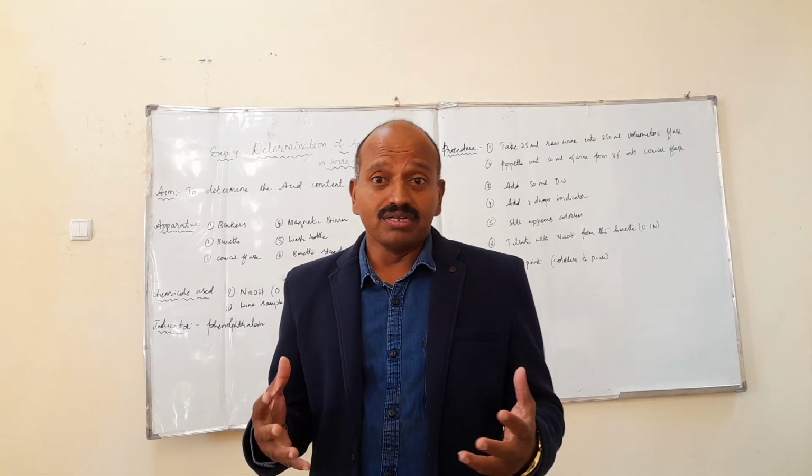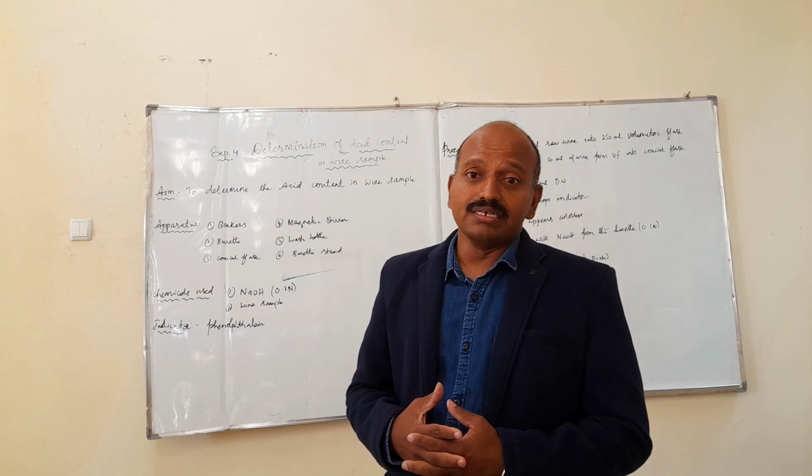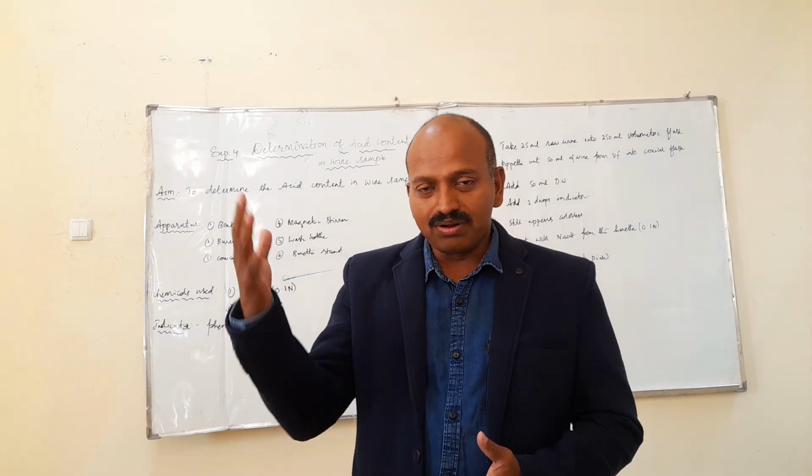Now let us perform the practical, physically, visually and practically, and get the values, and we'll come back to the calculation part in the second video. Let us perform the titration.